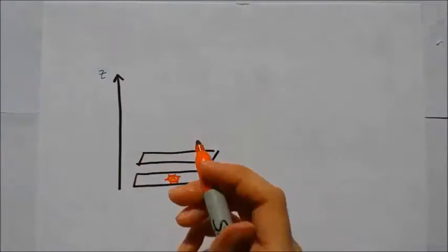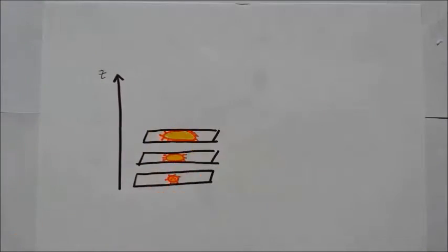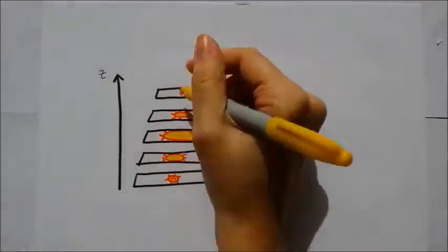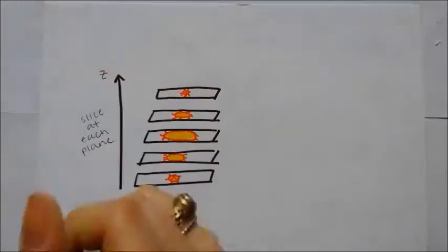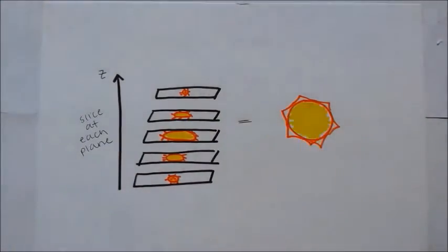One of the great advantages to confocal microscopy is that you can control the depth of field, which is also called the depth or Z resolution, to create optical sections of thick samples without losing image quality. The illumination is achieved by non-invasively scanning 1 or more focused beams of light across the sample, rather than sectioning using physical means, which would likely destroy the sample. This allows for the 3D reconstruction of a sample from images captured at different focal planes.